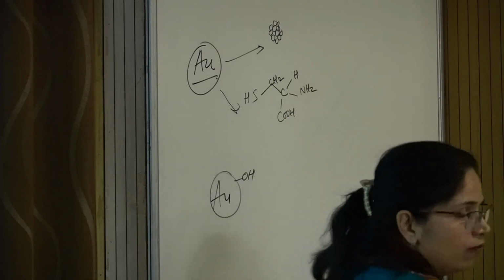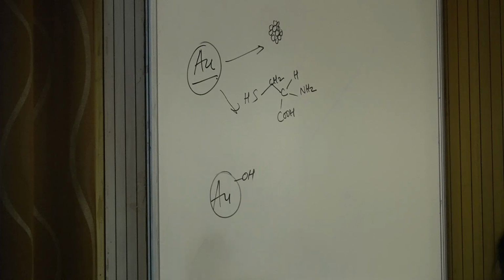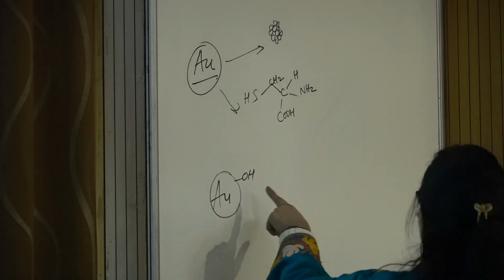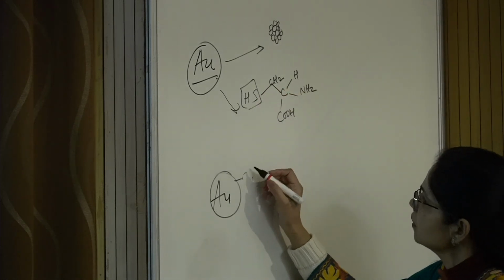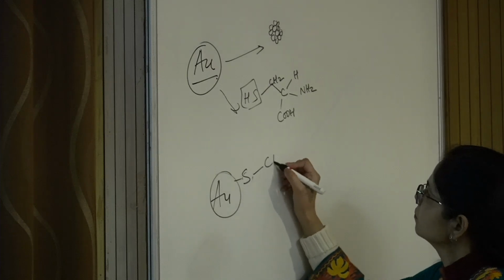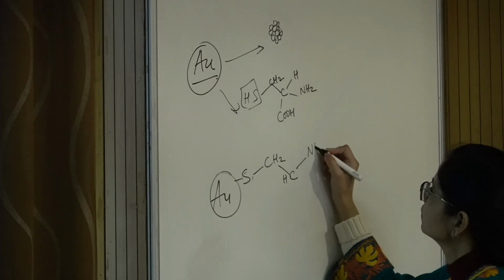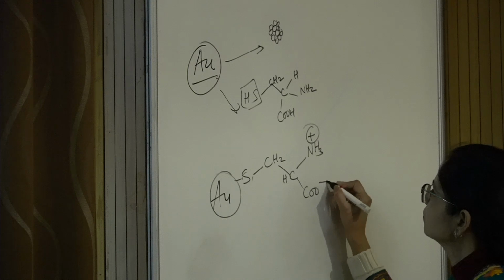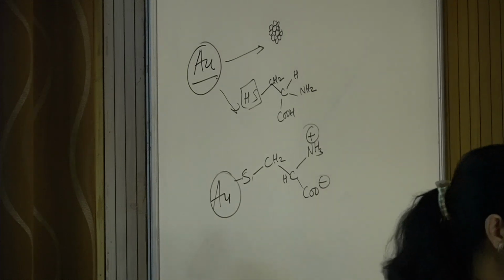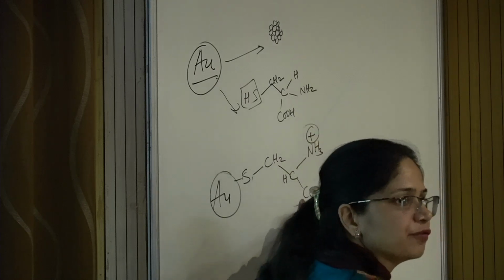like the gold nanoparticle is there, and if we are using water as a solvent, then we have surface hydroxyl group. So sometimes when we run the IR of the material, you will get the peak of OH group also. So now this OH group is there. So this can give you surface functionalization. Right? So now you can see there is a charged species at the surface.